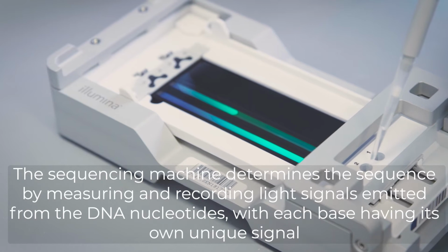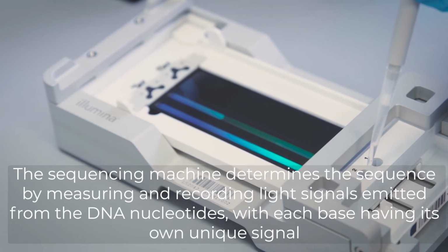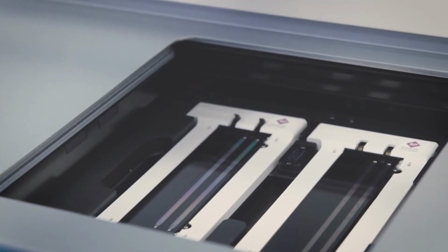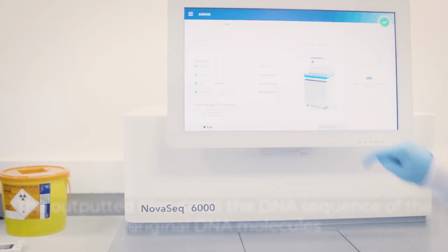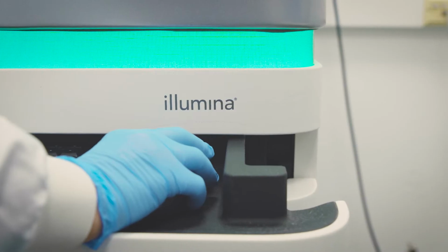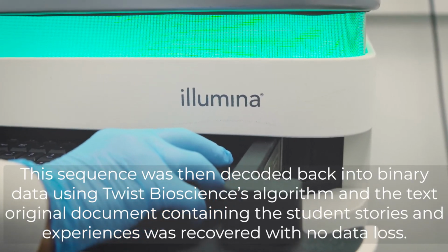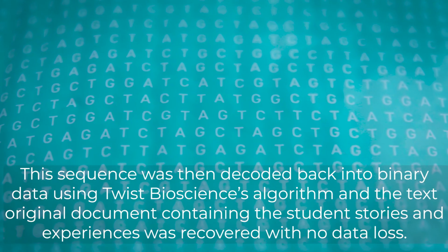The sequencing machine determines the sequence by measuring and recording light signals emitted from the DNA nucleotides, with each base having its own unique signal. The outputted files detail the DNA sequence of the original DNA molecules. This sequence was then decoded back into binary data using Twist Bioscience's algorithm, and the original text document containing the students' stories and experiences was recovered with no data loss.